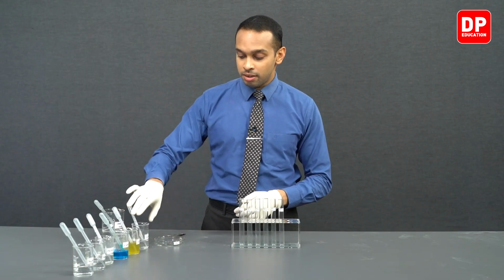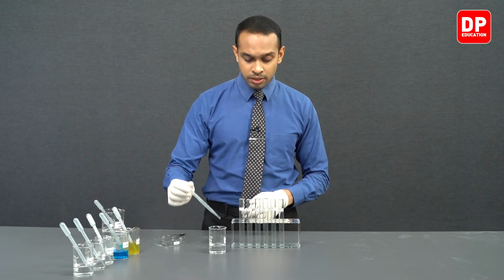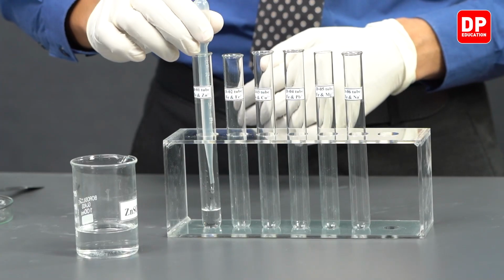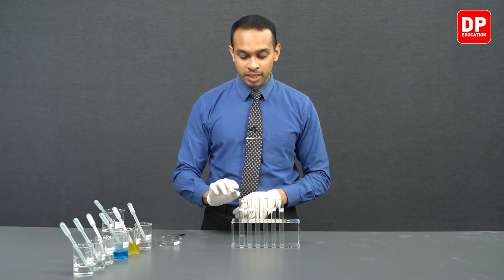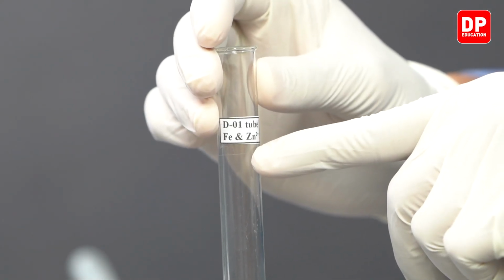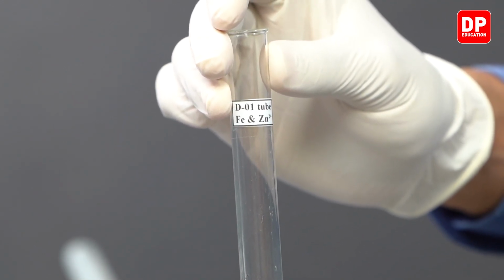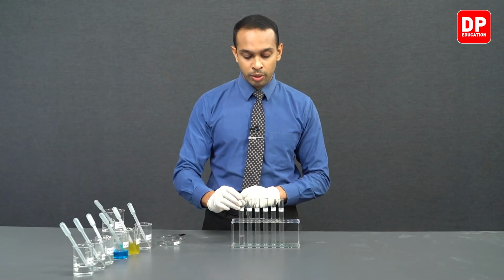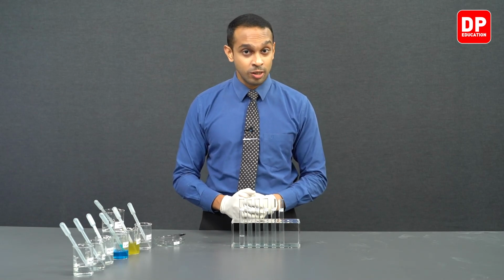So let's take our zinc sulfate solution, and we will transfer around 5 milliliters of zinc sulfate solution into the test tube labeled Zn2+, or in this case D1. Take a look at the tube labeling: the D1 tube is labeled Zn2+ and Fe. So this means we are going to add iron into zinc 2+ aqueous ion solution.